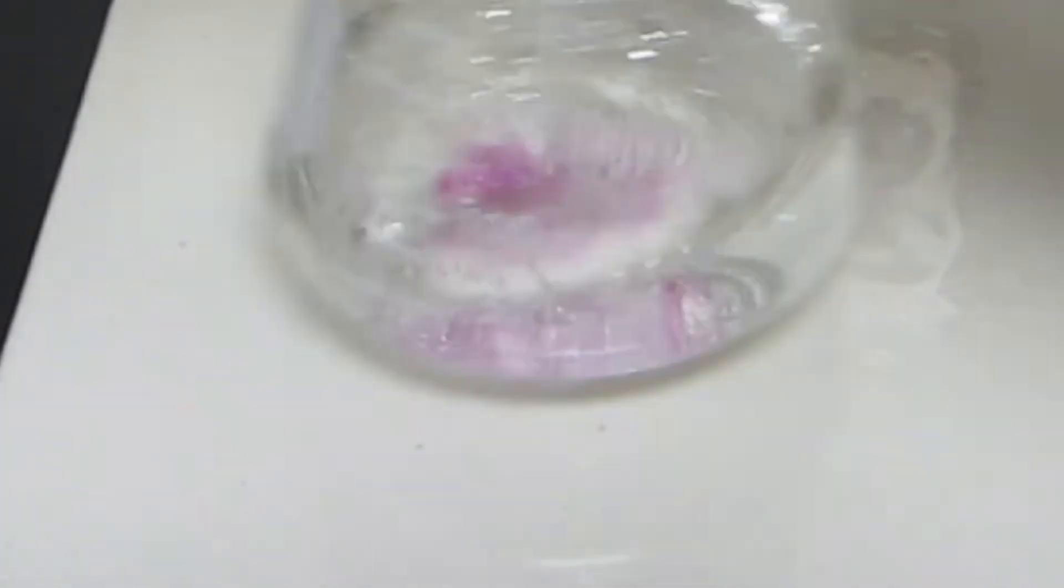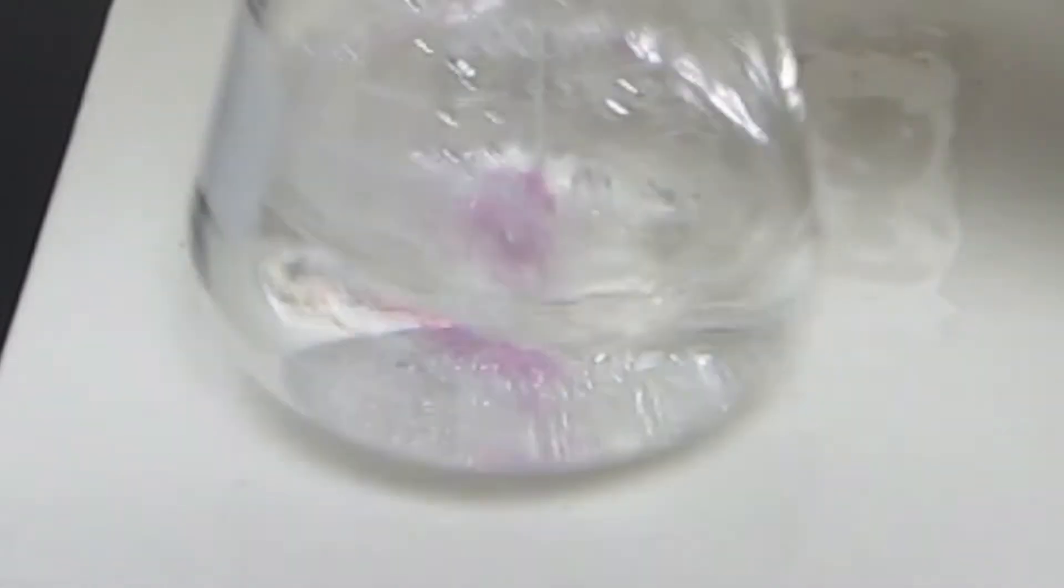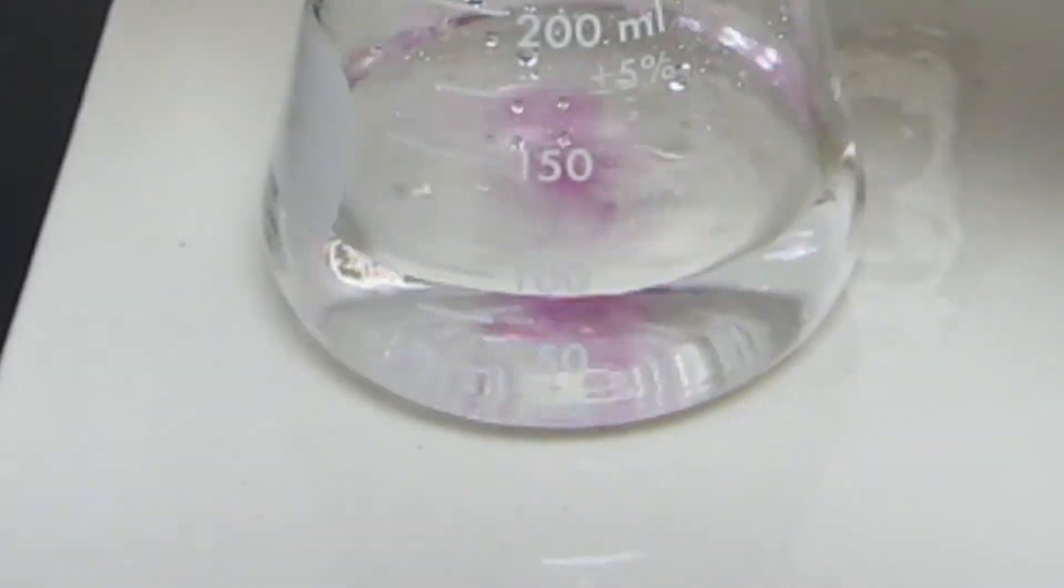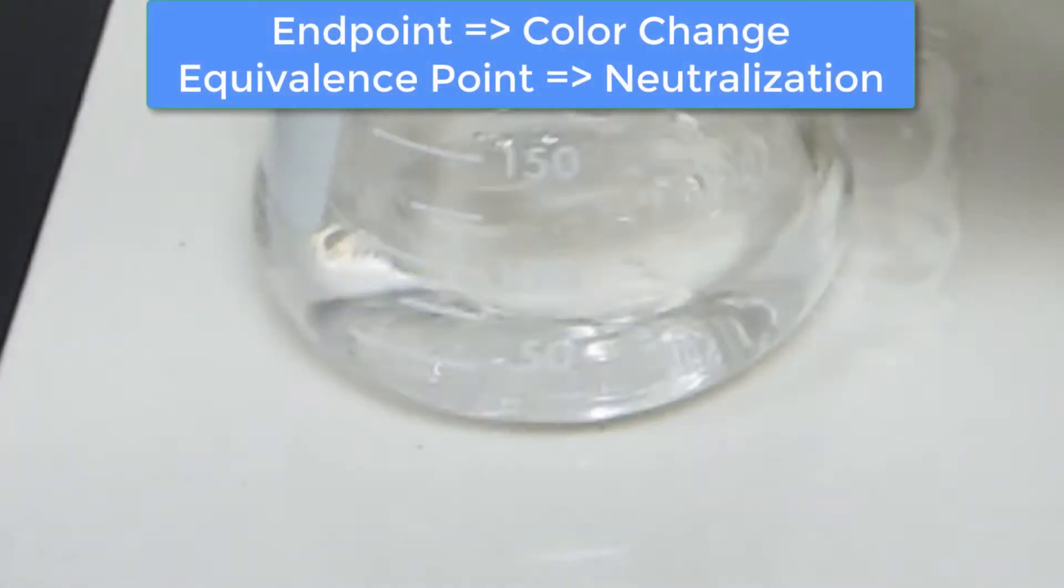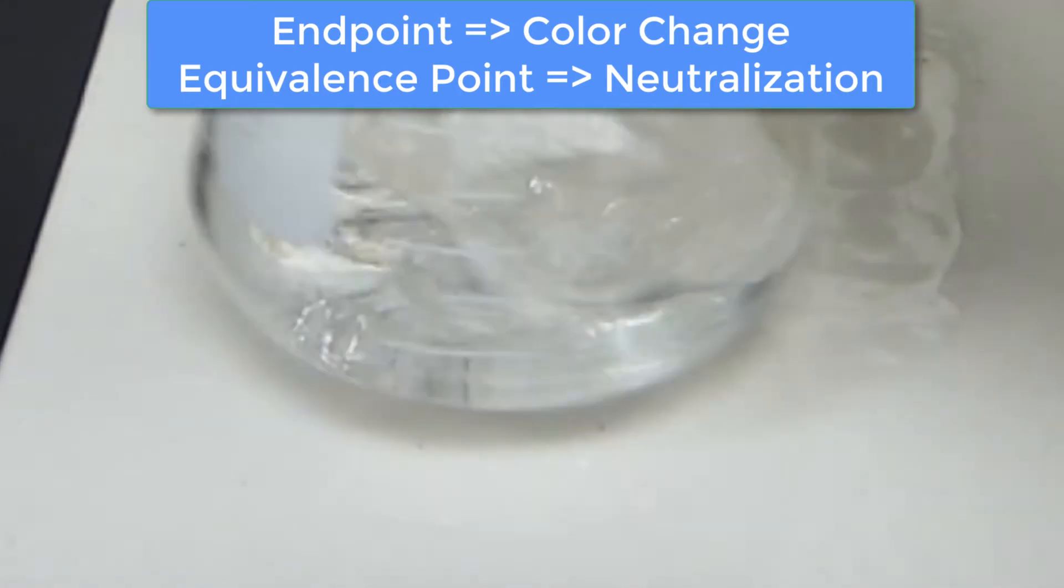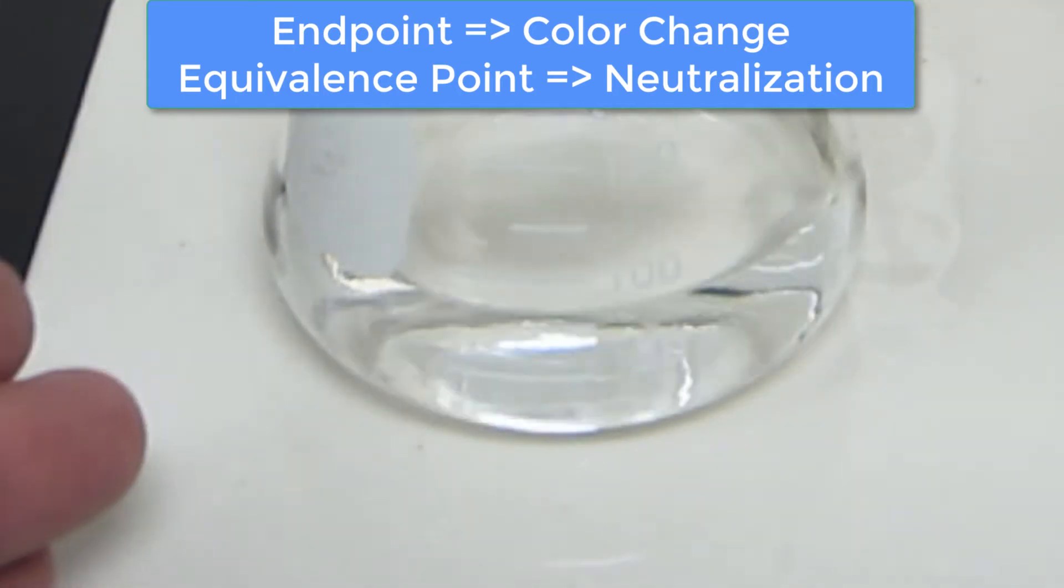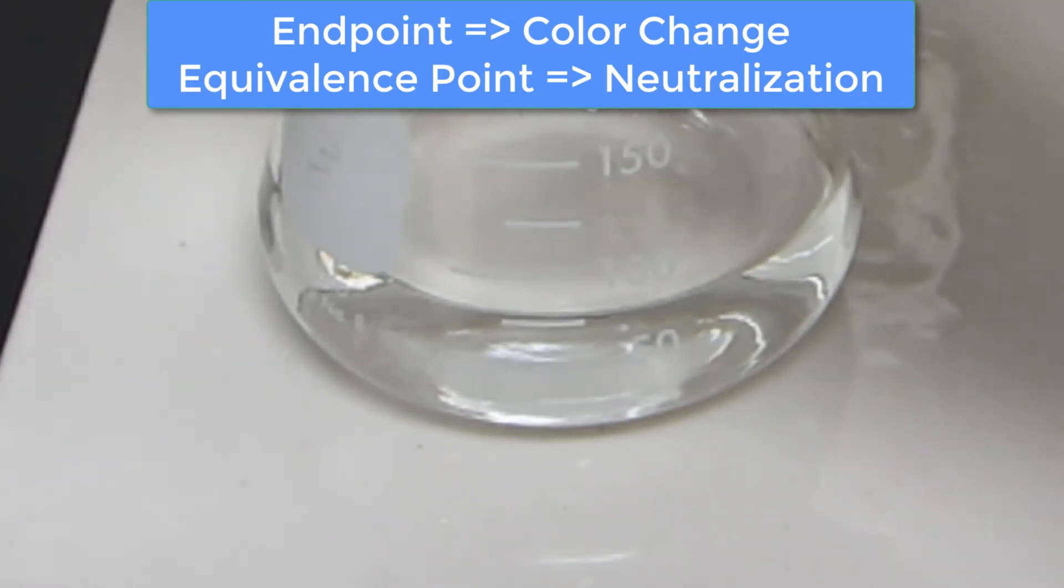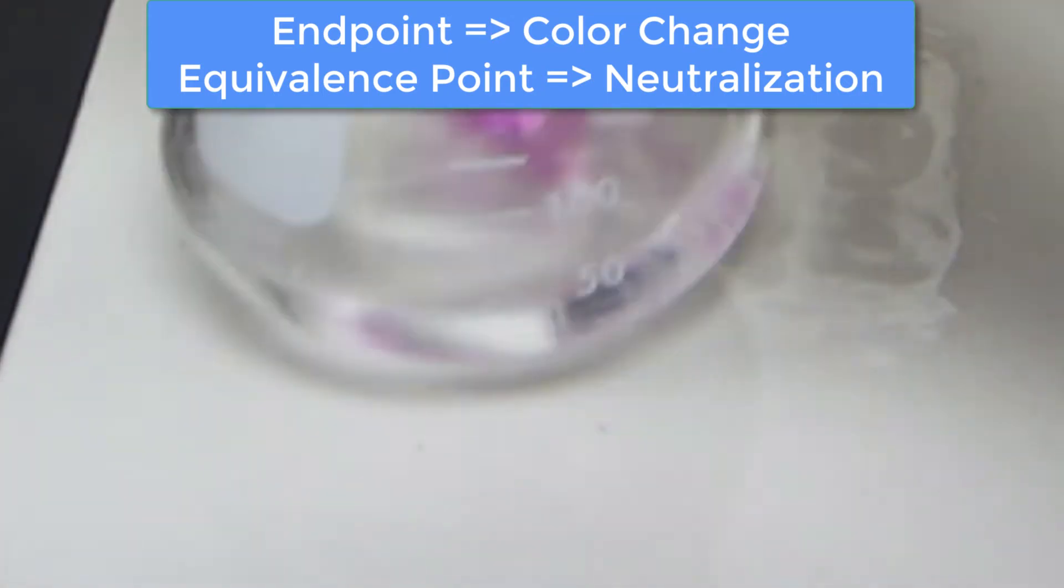Now as we get closer to the endpoint, that is, the point at which the purple color is going to persist, that is going to indicate that we are close to the neutralization point, which in the terms of titration is referred to as the equivalence point. The endpoint is where the color change occurs and the equivalence point is where the reaction is actually complete. Basically the two are going to correspond at about the same moment here, and that's what we're going to work with in our calculations.